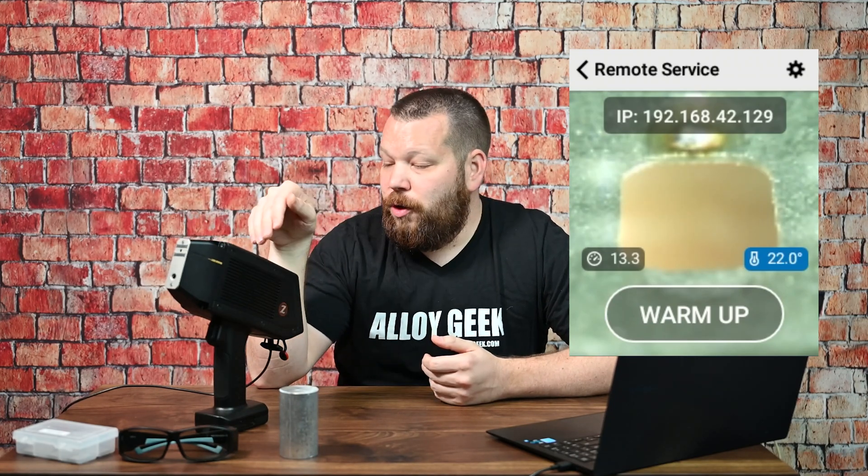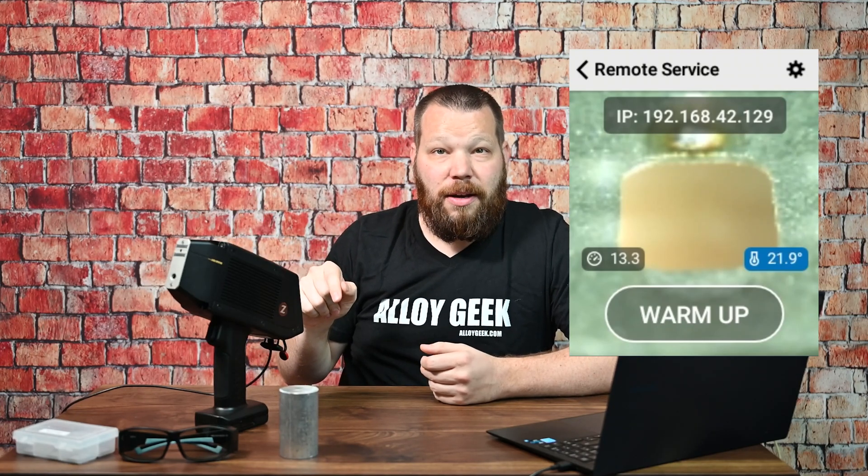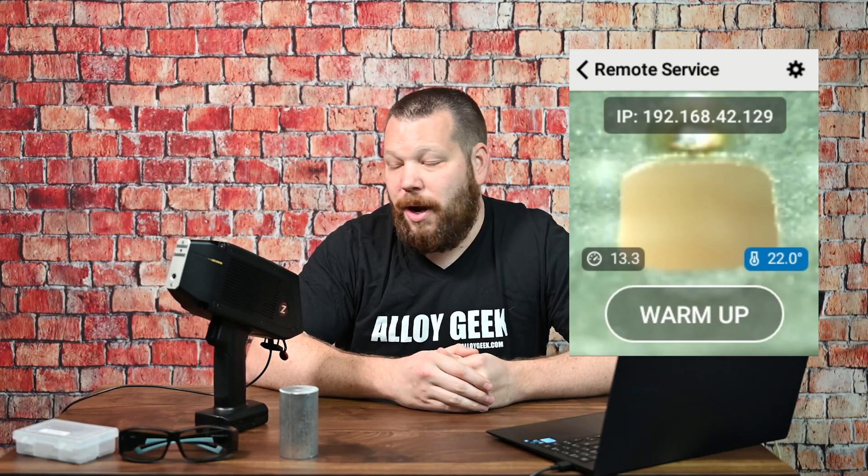I'm going to mirror my screens so you can see what I'm talking about. The startup procedure is pretty straightforward. You basically hold the power button on the top for a couple of seconds, and after you do that you're going to log in. It's the standard admin and then the password being 1-2-3-4-5. That's pretty standard and will work for pretty much every unit out there. You can set up your own passwords otherwise. Now that you're in your unit, you may get to a screen that says warm up.